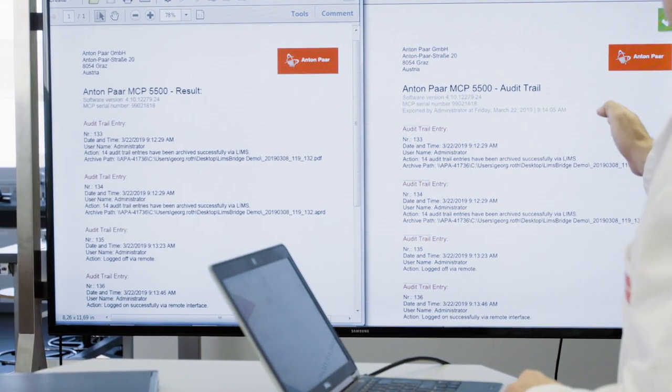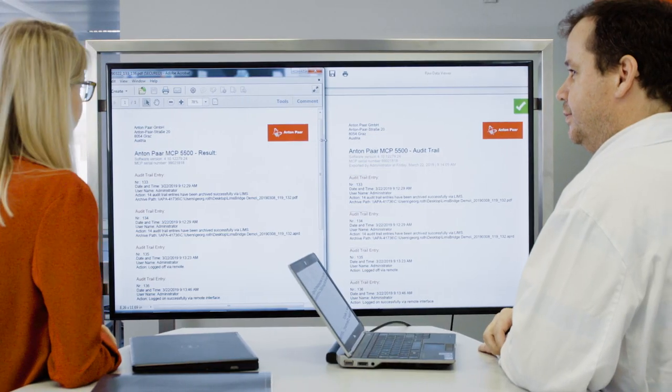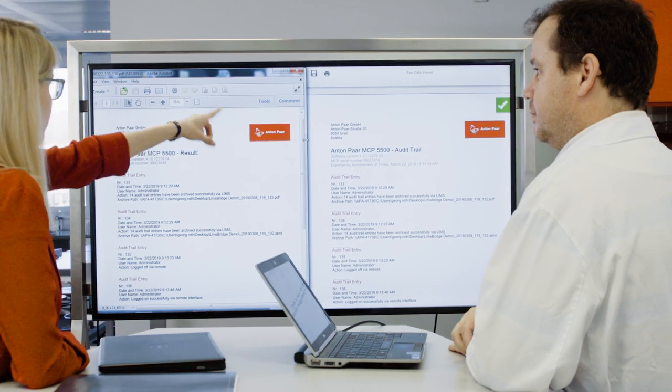Anton Parr's Raw Data Viewer allows you to securely browse through the measurement results exported by the MCP Polarimeter. The encrypted, digitally signed data is automatically checked for manipulation.